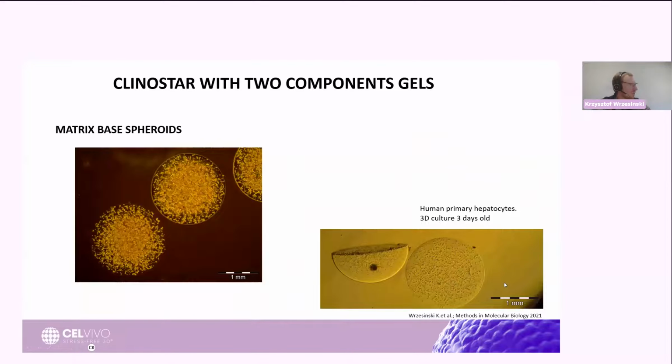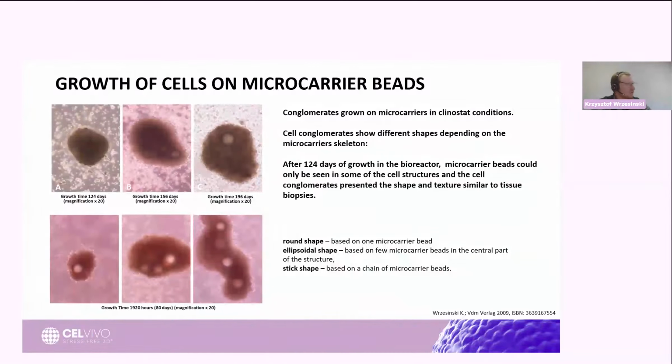We also have used gels, which are two-component based gels like Q-gels, and they all are working nicely in our system. I would say that not so long ago, I was actually asked by one of our collaborators whether we can support different shapes than spheroids, or spherical shapes. And the short answer is yes.